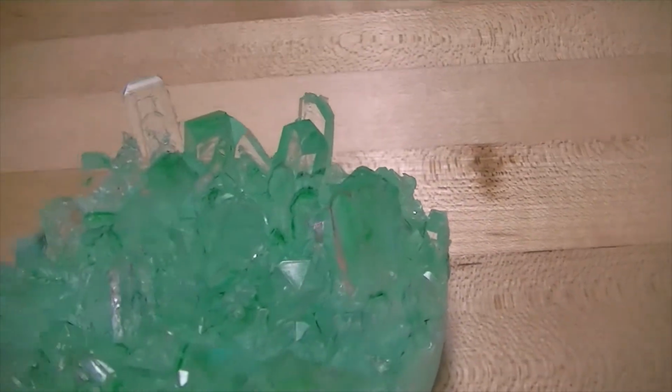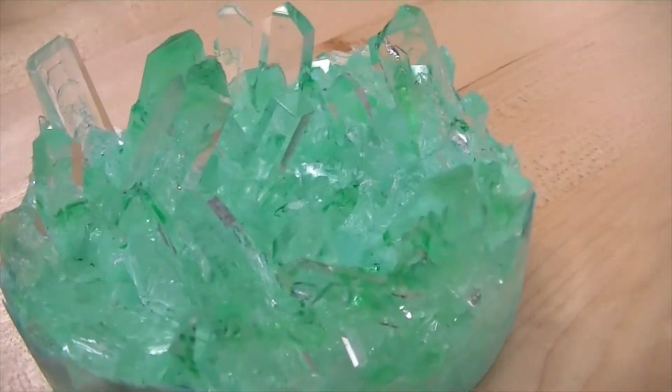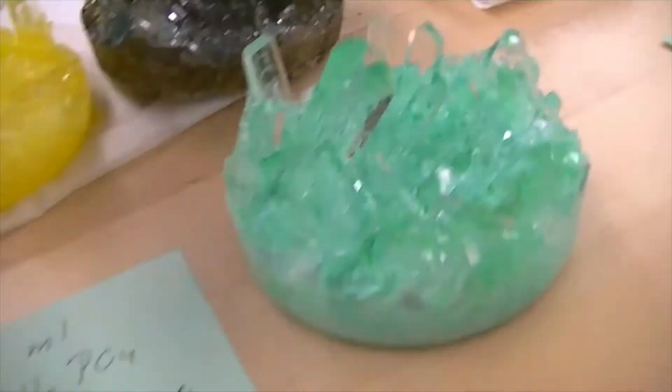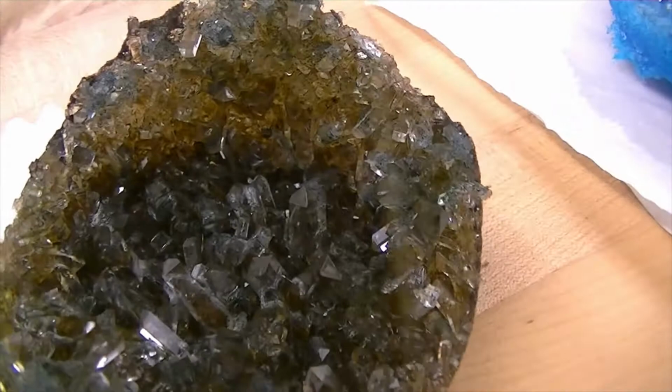And then if we go over here and look at number 1, the smallest concentration at 300 milliliters, and yet it grew very large crystals. Larger crystals, I'm going to move this over just for comparison, certainly much larger crystals than the highest concentration.